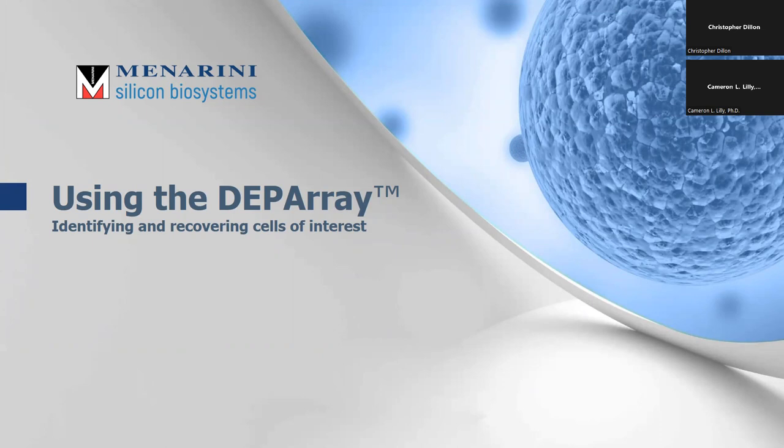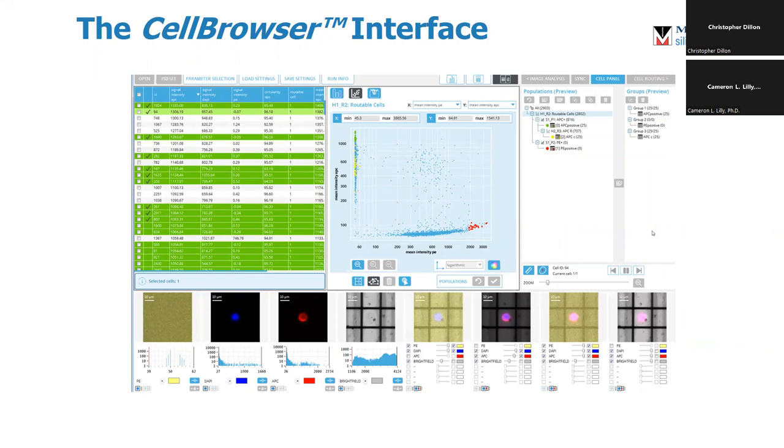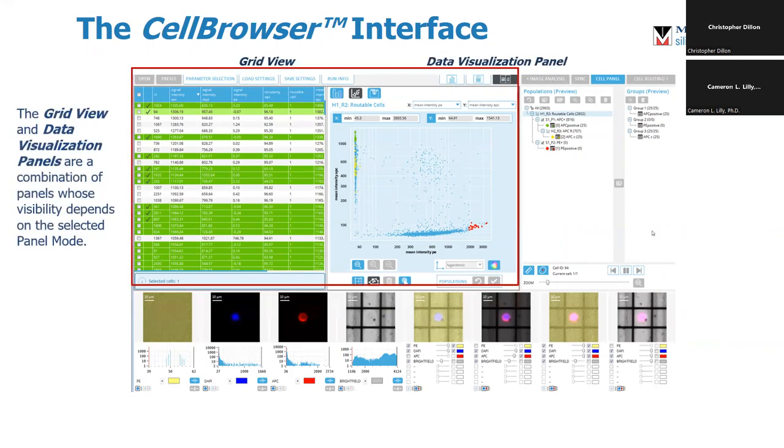So what can we do with this? It's very powerful — it allows us to get extreme resolution on individual cells. Once the cells are all trapped, the chip is scanned by the onboard fluorescent microscope. All particles are given a region-of-interest identifier, and all fluorescent parameters as well as morphological data are captured and assigned to this ROI. That data is fed into the software called the Cell Browser. There are three main parts: first is the grid view and data visualization panel — the numerical grid for all data collected for every particle. These dot plots look exactly the same as in flow cytometry, so you can put your intensities on your axes and pick the cells that you want. Histograms are available as well.